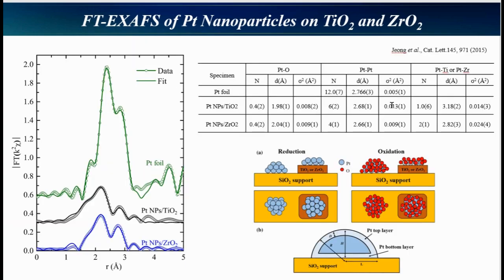The data fitting results are shown in the table and the figure. As you know, to get exact local structure information, we must do the fitting process. However, we can visually check structural information in wavelet transform EXAFS, including atomic discrimination, in advance of fitting data to a model.